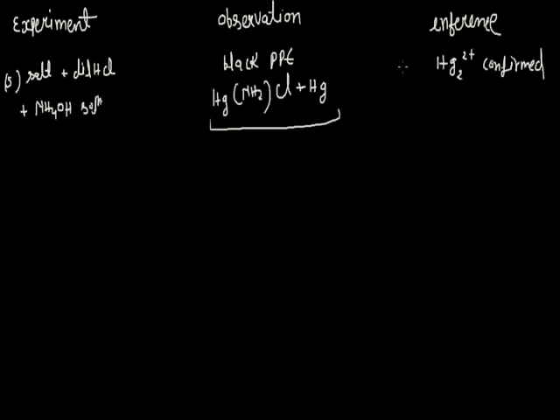Now for further confirmation of the mercurous chloride, dissolving this black PPT in aqua regia.